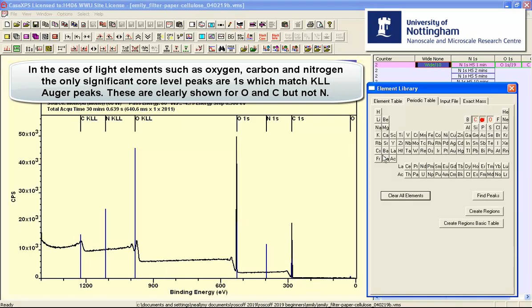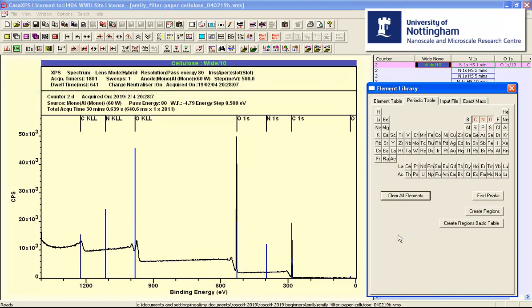In the case of nitrogen, this is the peak that we're wondering about. Well there's no evidence of peaks at the nitrogen 1S or the nitrogen Auger. So taken together, the element library has only found two elements.